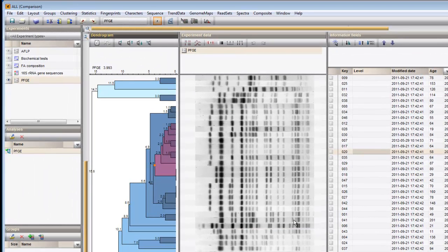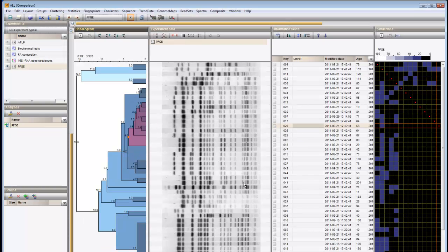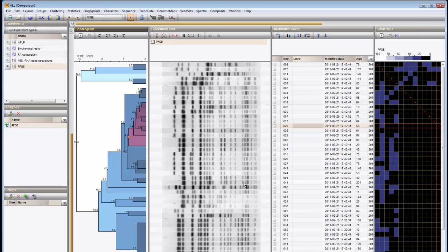When branches are colorized, the highlighted branch is always displayed in pink. On the right, there is a panel showing the similarity matrix with differentially shaded cells.